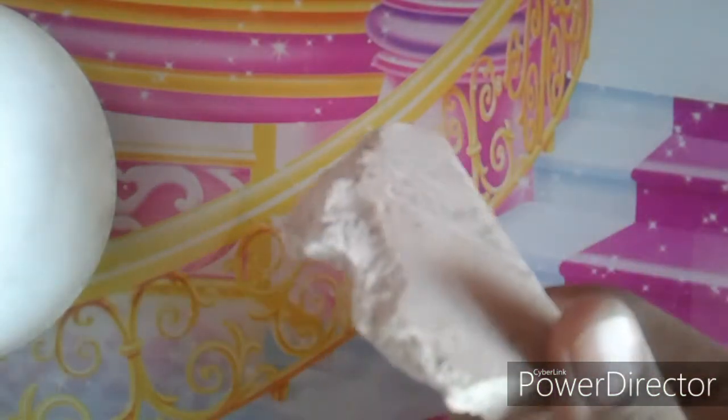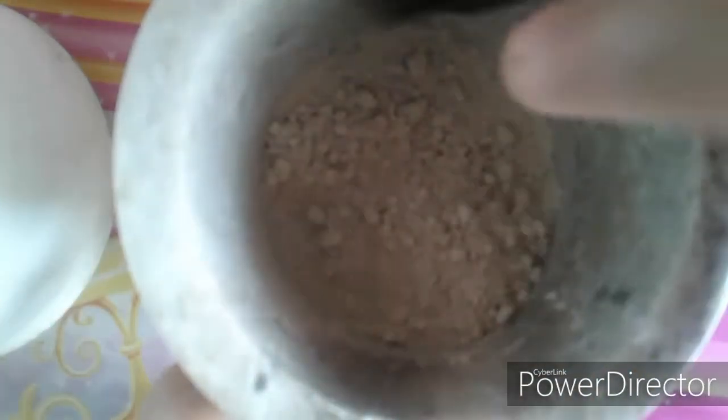Now that all the impurities are removed, we are going to grind this and beat it hard so that it breaks into fine small pieces of calcium sulphate. You can see the fine powder forming as I beat it.